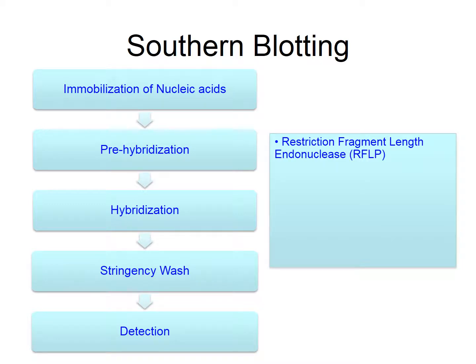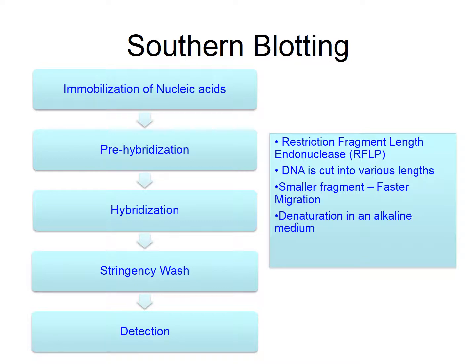Now, as we've learned before, restriction endonuclease is used to produce different cuts of the DNA to produce different restriction fragments, and this particular fragment is allowed to run on a gel, as I mentioned, and the probes are used to identify various defined sequence of this restriction fragment. This particular video, which I will be attaching along with the study material, can help you to understand the entire process in a much more detailed, visual manner.